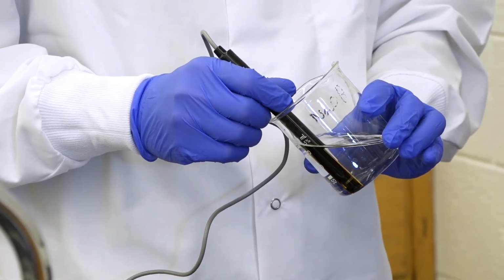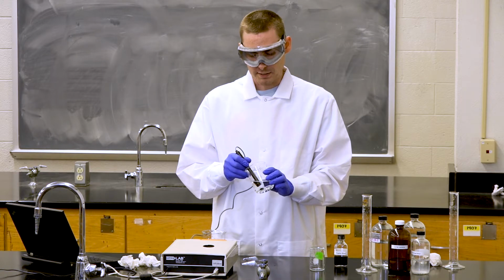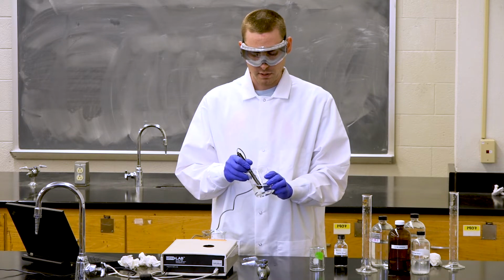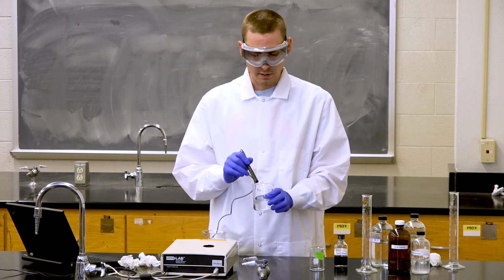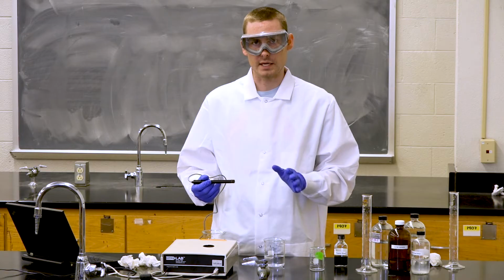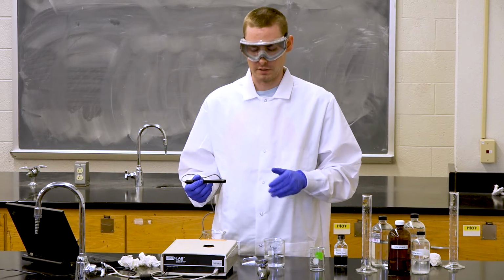The conductivity should have gone down significantly from your previous readings, but it will still be higher than when you had the tap water. That is because you've neutralized the hydronium and the hydroxide ions that were in solution, and these ions tend to carry charge better than sodium and chloride that are in solution.